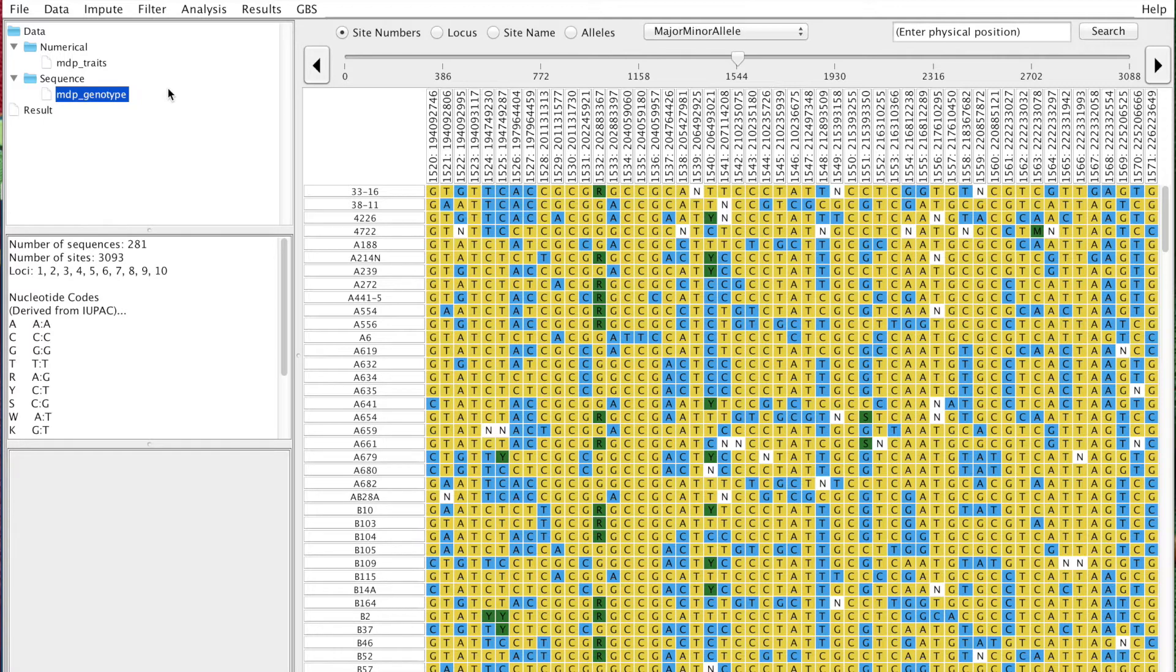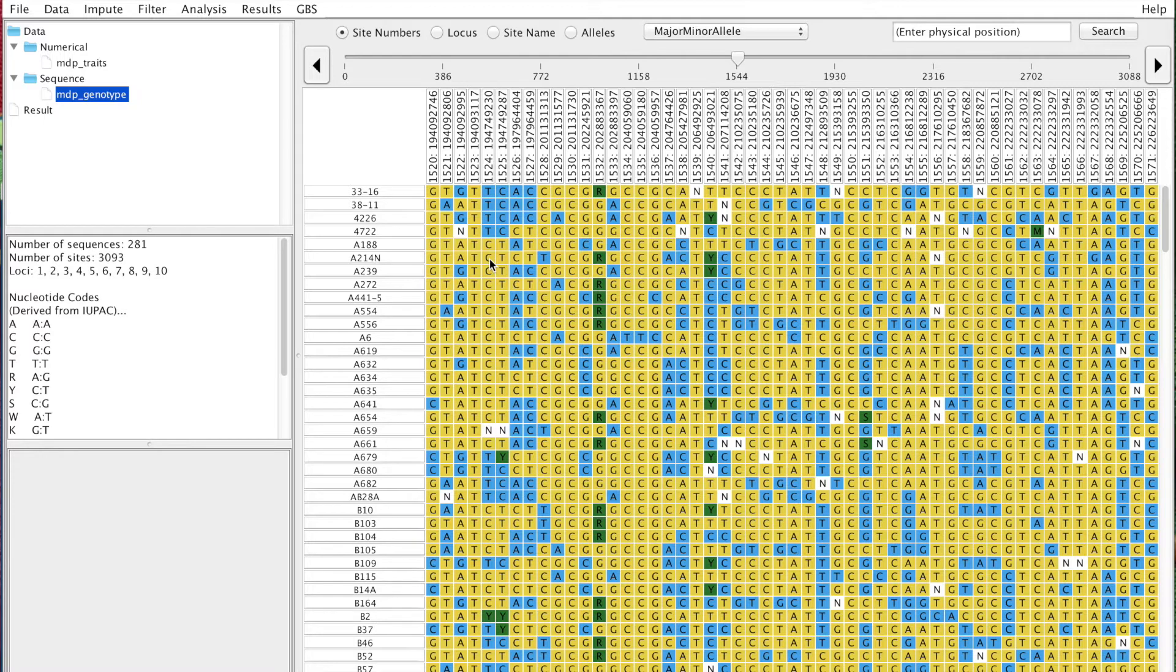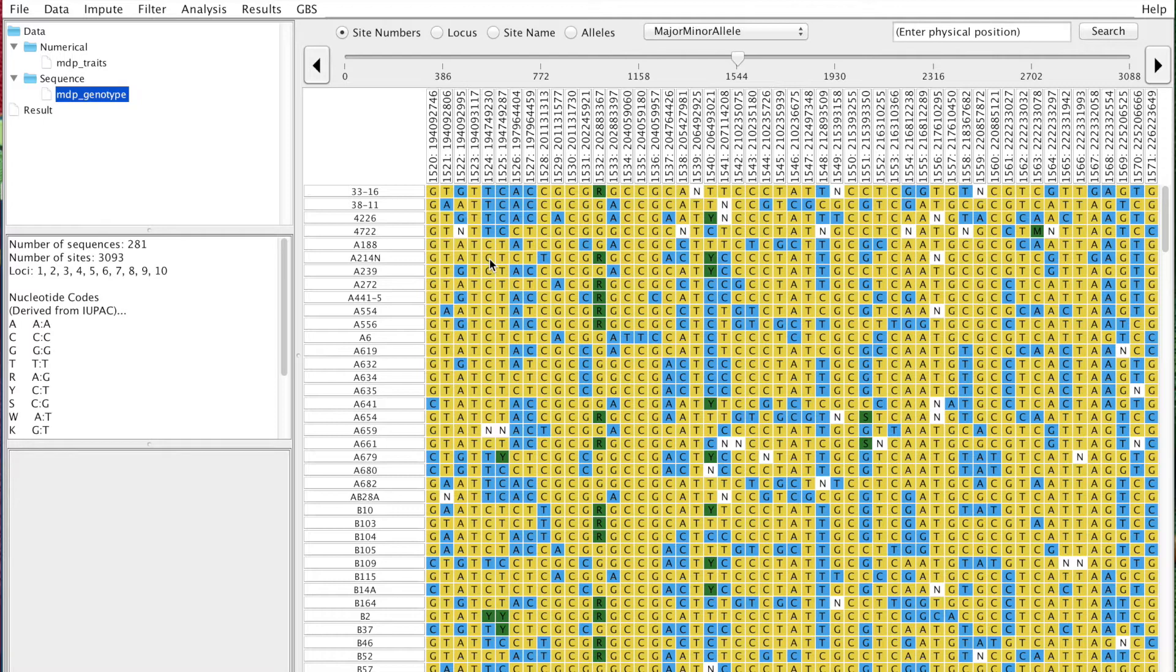but it really isn't. Let's start with genotype. Here we have the sample dataset with inbred lines, but you can have your own population with biparentals or outcrossing individuals. This is important because it will affect expected allele frequency and heterozygosity. We can look into those values here.